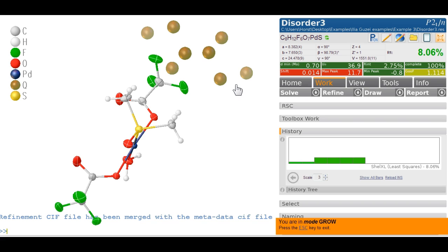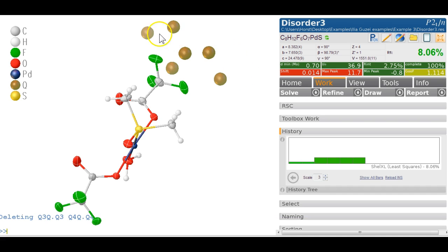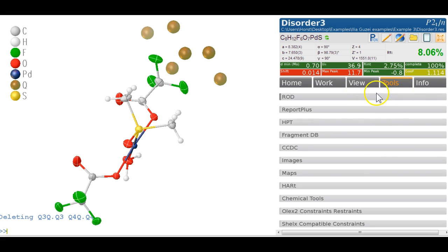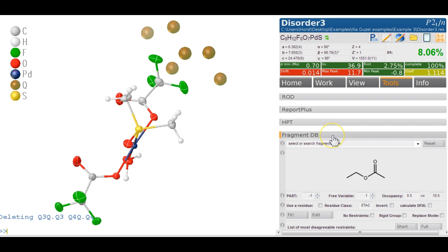In OLEX2, the way to deal with this is to basically delete everything you think you don't really want. So you delete this and you can see the molecule now, and then we go shopping and can get this molecule from a variety of sources. One of them is in the Report Plus extension module, but I meant Fragment DB — you can type 'ethyl acetate' and there it is.